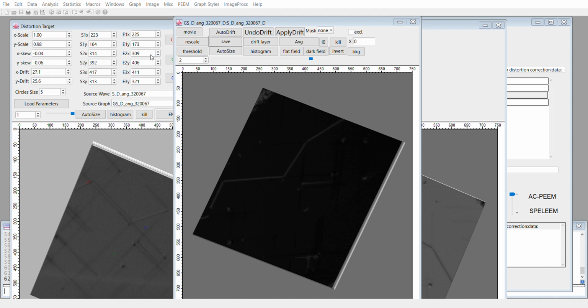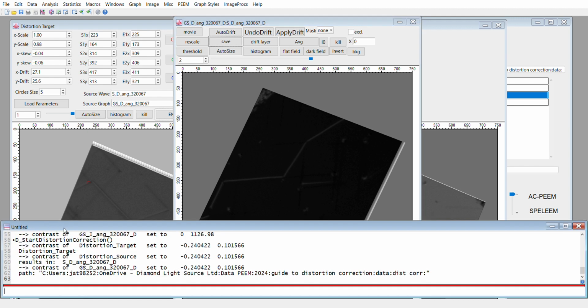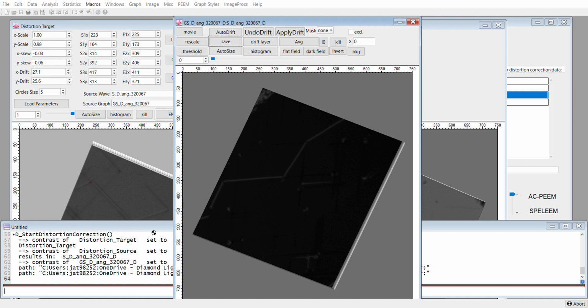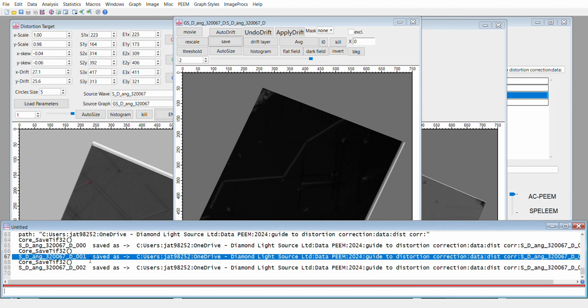Okay. Select folder. Okay, I think we have to do this save procedure again. You just repeat it using full stack, and now you can see that the data have been saved.